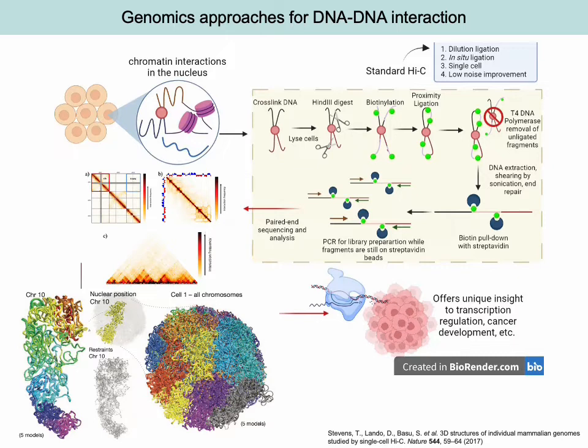Now you can apply Hi-C on the tissue level. There are commercial kits to support that, and in some labs right now, and I think there are also some commercial kits for single-cell Hi-C to be used as well.